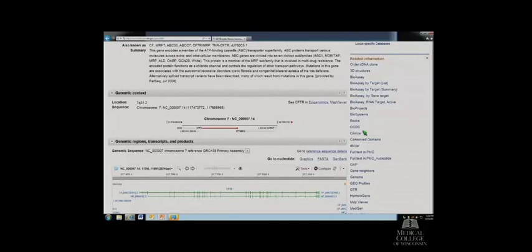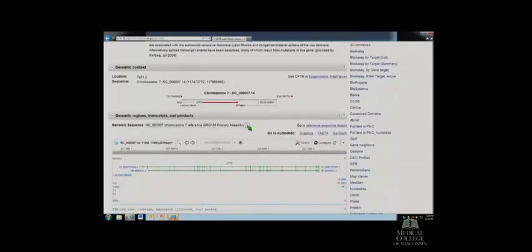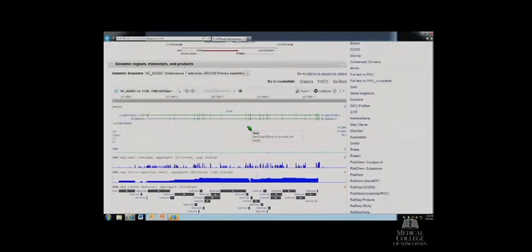So like I said, I'll probably repeat that, but going back to the main record side and scrolling down a little bit farther, I just want to point out a few things in the sequence viewer section. This is kind of fun. I like to play with it. There's a lot going on here that I don't necessarily understand at all, but I do know a couple of tips and tricks that I'll just point out here.